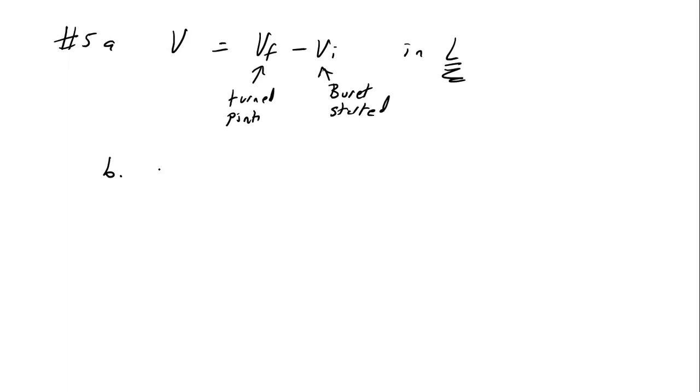Okay. Number 2 is the moles of KHP. If I weighed out solid KHP, how do I find the moles of it? Mass divided by molar mass. So the mass divided by the molar mass. And so this was measured. Okay? For both, you're going to do 2 titrations of this one and 2 titrations with the vinegar.